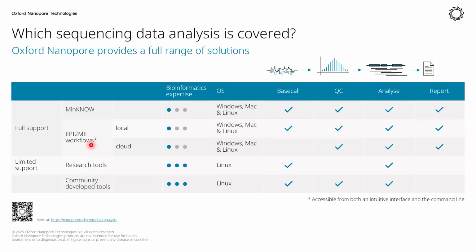It's very user friendly, point and click. Literally, it does not need additional bioinformatics expertise. It can also be run using the EPI2ME desktop interface or through the command line, so it depends on how we want to run this. And I think Matt is also going to talk about what GitHub tools we can utilize in order to do the data analysis.